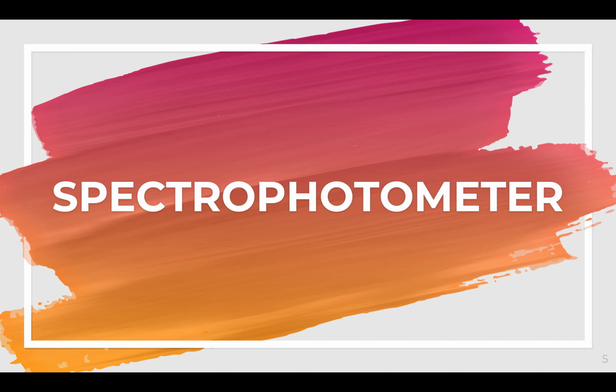Similar to what we were discussing when we discuss your Beer's law, isn't it that when computing or measuring the concentration of your analytes, take for example your glucose, your cholesterol, or even your triglycerides or whatever analytes you want to measure, what we are actually using is your light. So you introduce light to your sample and then you compute your absorbance by technically computing your percent transmittance.